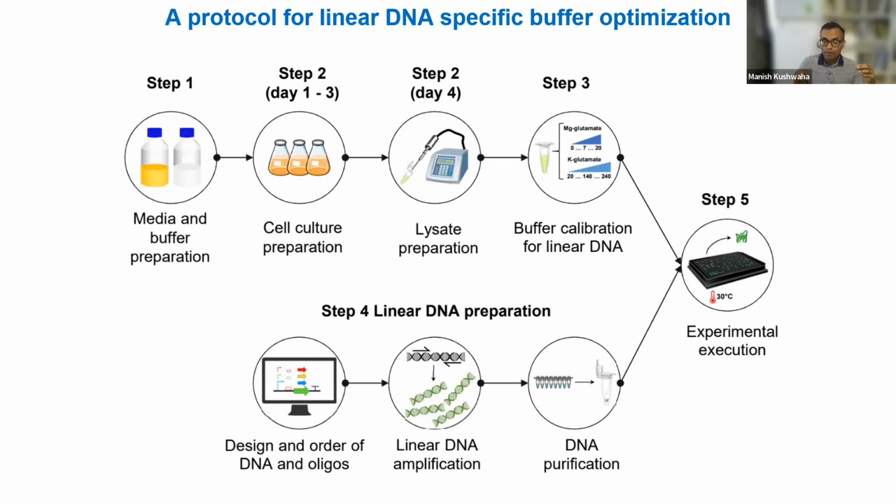So there may be plasmid to plasmid differences, and there are definitely linear DNA to plasmid DNA differences in terms of the optimal buffers to use when running your reaction. So we have a workflow here of how to, I mean, to the cell-free audience, this is something very common. You will understand exactly what's going on here.